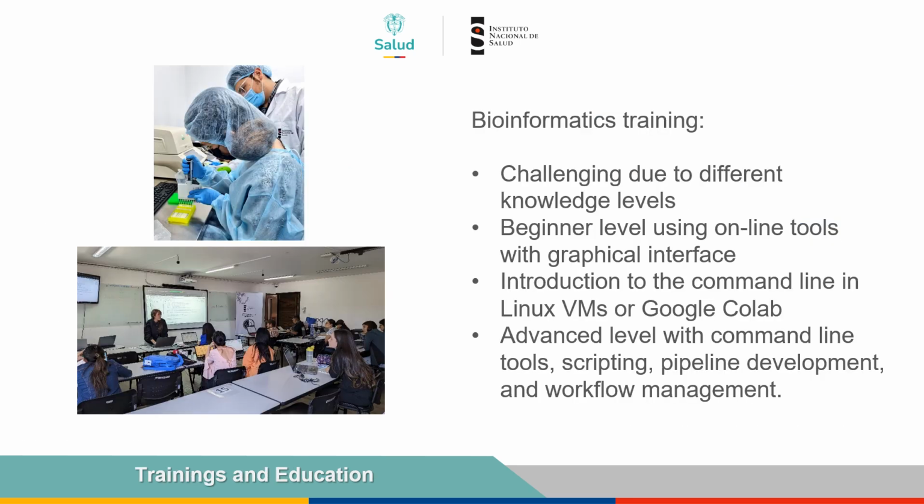The bioinformatic analysis was performed using the ARTIC network tools with ARTIC field bioinformatics.